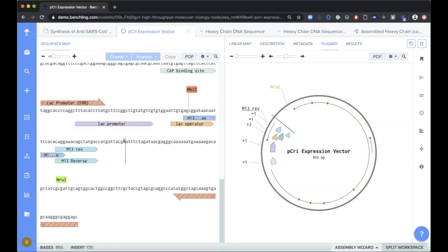So before I get into the bulk assembly, similar to the codon optimization step, I'm curious to know what type of vector design tools you are currently using. And so we'll have another poll up here and just take a few more seconds to toggle and see which plasmid assembly tools you are currently using.